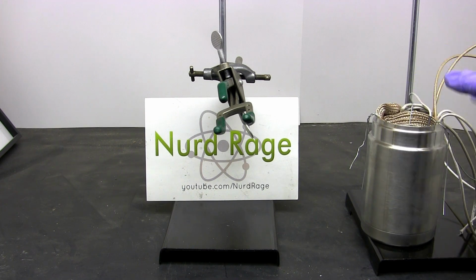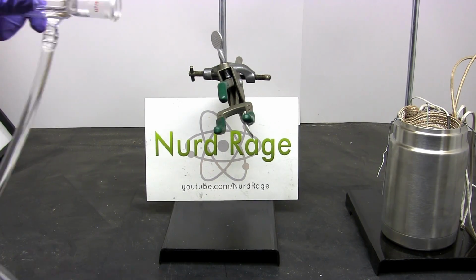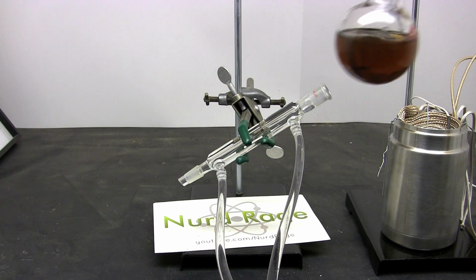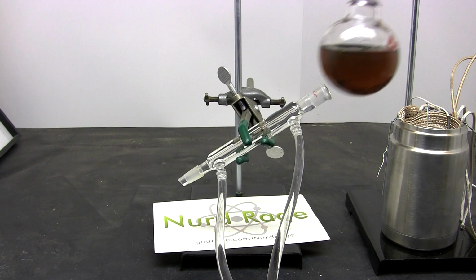We start with the heating mantle that we built in a previous video. Mine is connected to a variac off camera. Now we get a condenser. Mine is connected to a water supply also off camera. And here is a 100 milliliter round bottom flask filled about halfway with sulfuric acid from drain cleaner. As you can see, it's quite dirty.